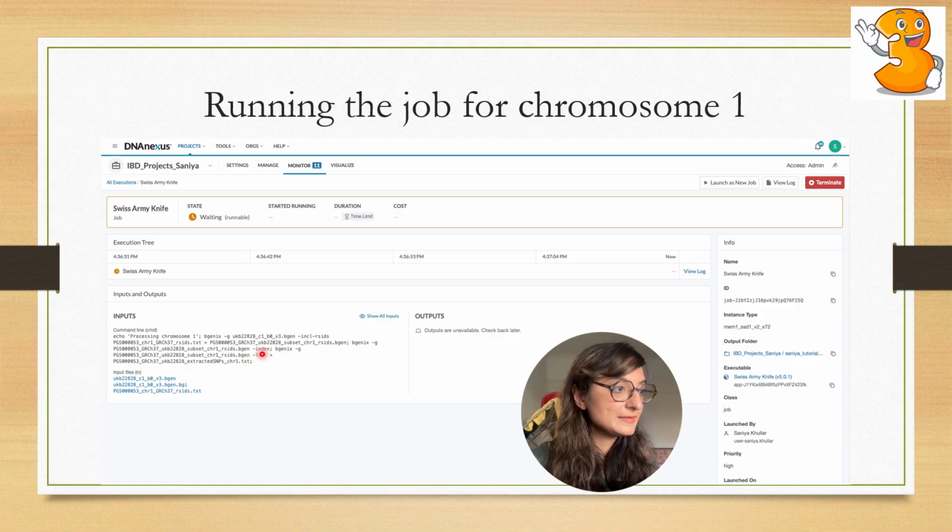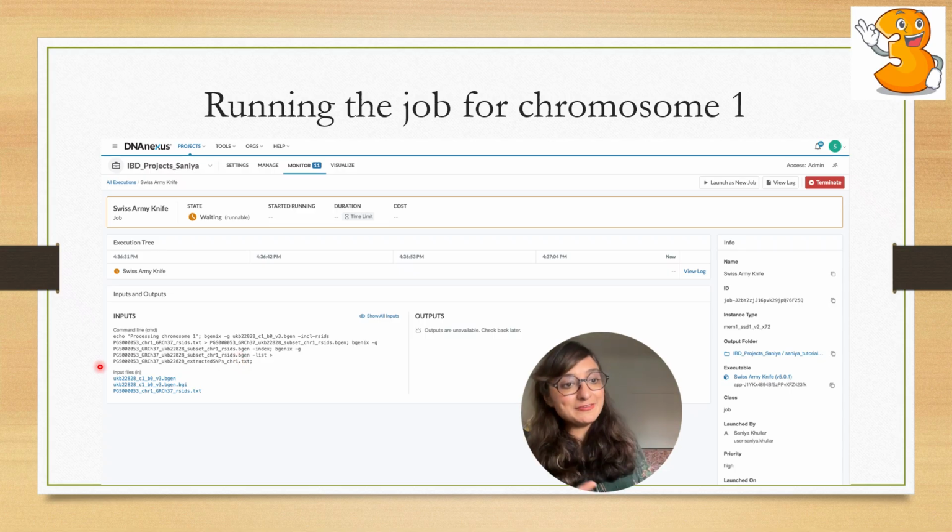And the last command, which is optional, is just trying to list the variants found from the BGEN file into this text file for our reference. It's just telling us what was found. The BGEN file will have the genotype data, the dosages of the individuals, but the text file is just going to tell you which variants we have that data for.